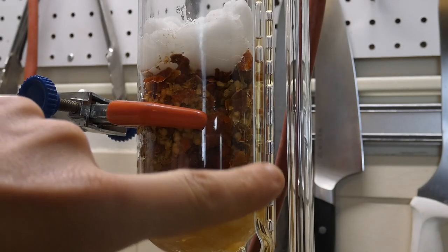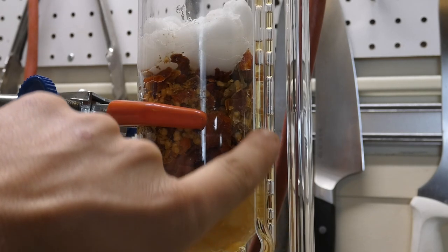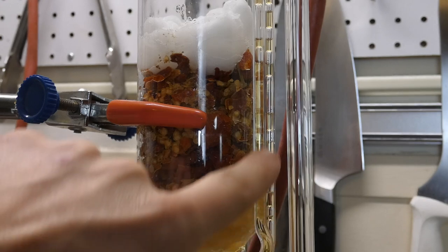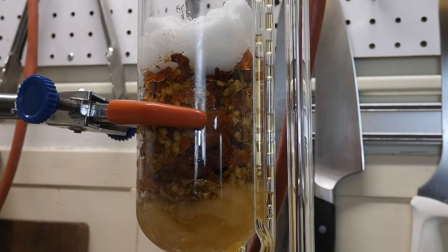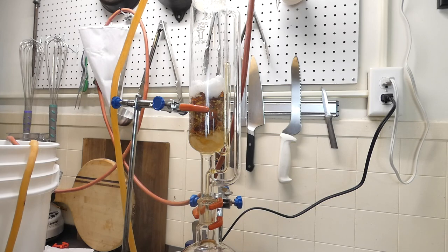All right, so it's been 3.5 hours. Let's take a look and see how it's doing. As you can see, the liquid in the arm tube here is still quite tinted, so we're gonna let this go for a little bit longer. We're looking for this to be completely clear. Then we'll know that the extraction's done and we can go to the next step. All right, so this is pretty much done. We're just gonna turn it off and let it cool down, and then we'll go on to the next step.